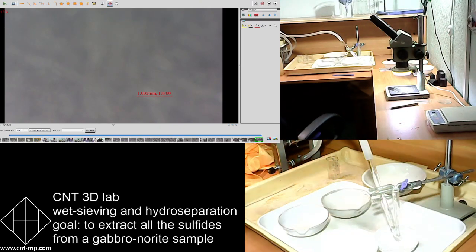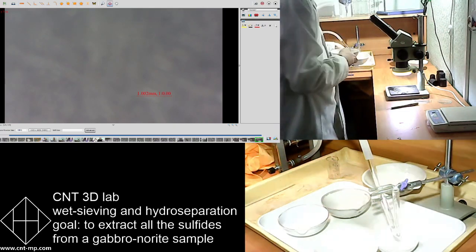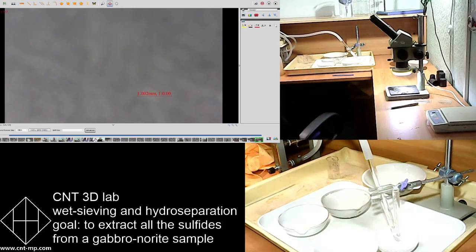So you need to fit as much material as possible into the tube, and you are not so cautious about the sensitivity level, say. You have to cut the amount, right? It will still be the same representative balance of minerals, but then you have to cut the size. So the distributions of heavies and lights will be the same, but the amount will be smaller.